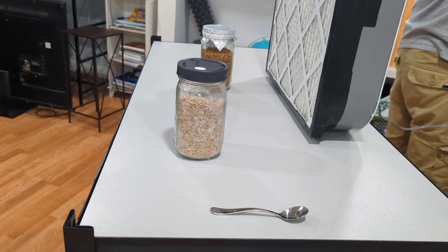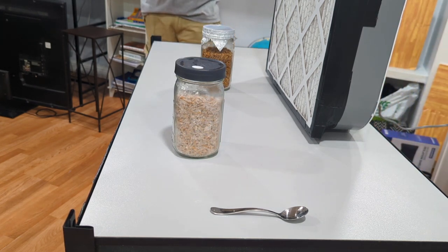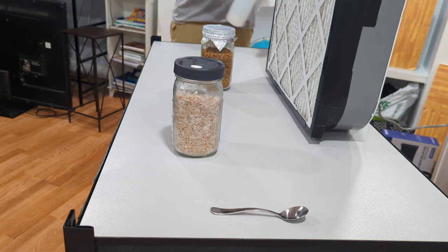Today we're going to go over a grain-to-grain transfer using a spoon. Make sure your spoon is either sterilized or you sanitize it in front of the flow hood with 70% isopropyl alcohol.